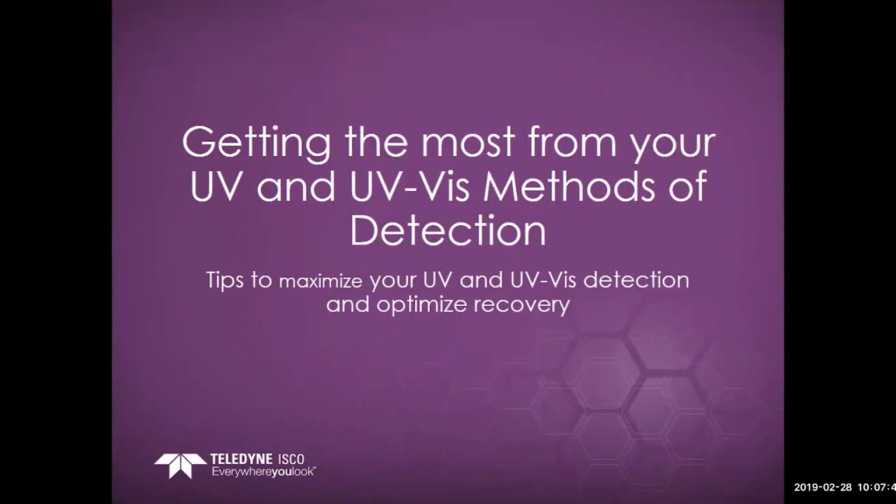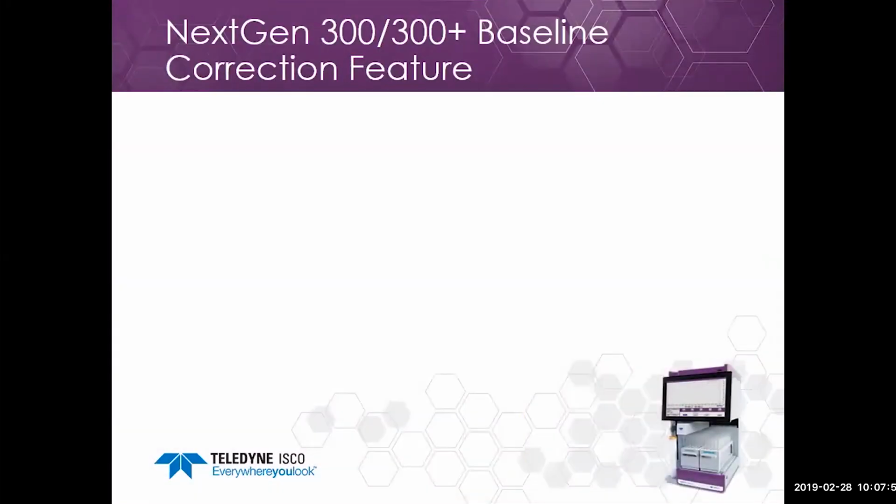So the first section I want to focus on is getting the most from your UV and UV-Vis methods of detection. If you can maximize using the UV and UV-Vis, you can avoid using destructive techniques like the ELSD and mass spec. And it's also a little bit easier to use.